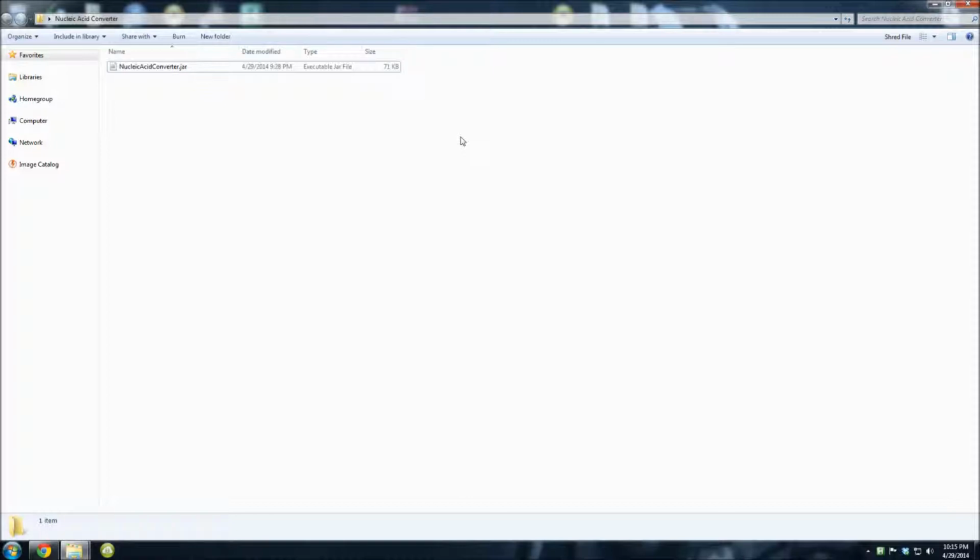Challenge. This program is very helpful for biology people who convert large DNA strings or need to find restriction sites on the ends of their DNA strings, and it's just a very helpful and nice to use program.